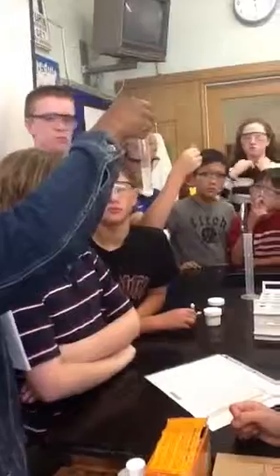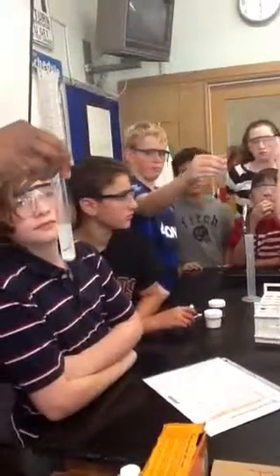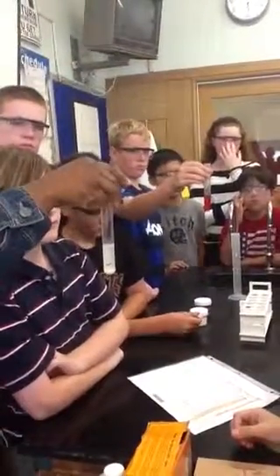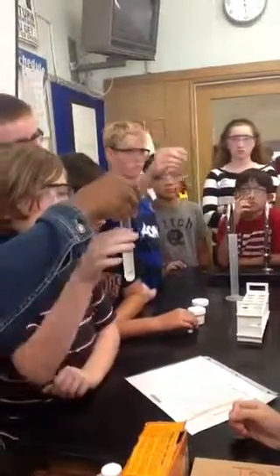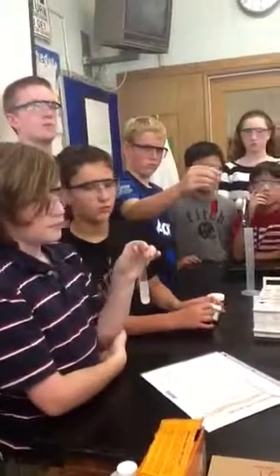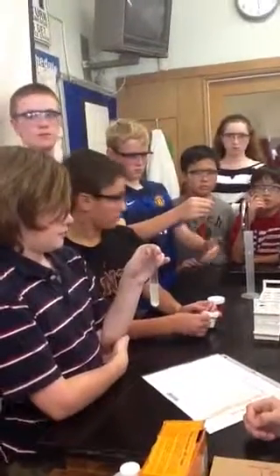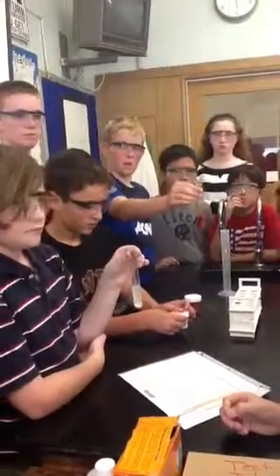Look at this. Look at the red. How is this different from the red? Color. How is it different from the red? Yes. White is opaque and red is kind of translucent. Okay. Transparent. It's not really transparent though, because transparent would mean that light can get through really. Do you think light can get through there? Yeah, I guess, but translucent would be a better word. I think sometimes we use both of them.